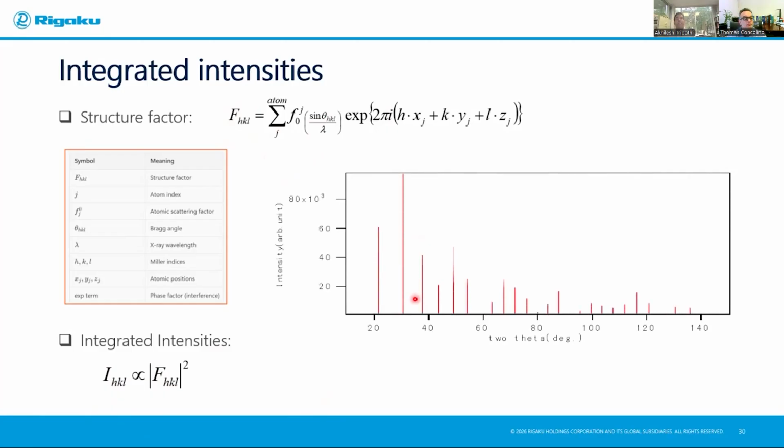So if I may present this with a picture. When you load your phases, after finding the phases, the software has the idea. Like here are your peak positions, just as lines, not as profiles. So that's step one that has happened inside the program. It knows where to build the peaks.